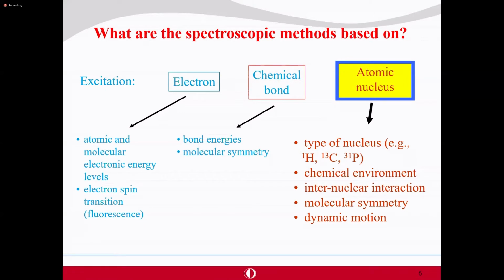If you look at what the spectroscopic methods are based on, NMR is not the only spectroscopic technique that we will be using, and tomorrow we have a full day mostly dedicated to IR and data analysis. Usually the bond energies or stretching vibrations give us information by using NIR spectroscopy.